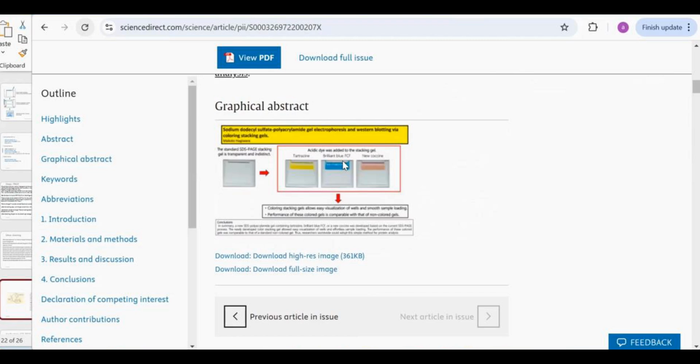Similarly, you can identify variations. So isoforms you can find, or strain species, that is from different bacterial species. If you isolate the same protein, is there any variation? Then that can be very well resolved using SDS-PAGE. Then protein-protein interactions can be analyzed using SDS-PAGE. Of course, protein contaminants can be detected. Then protein peptide mapping can be done. Post-translational modifications you can visualize, right?